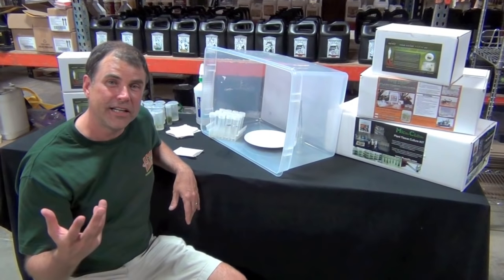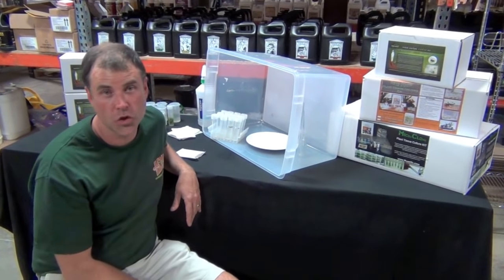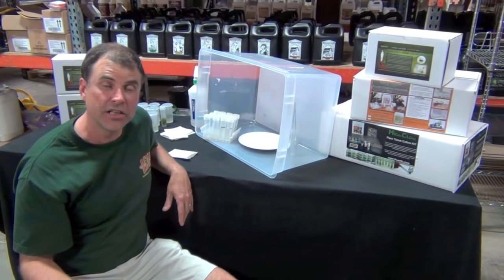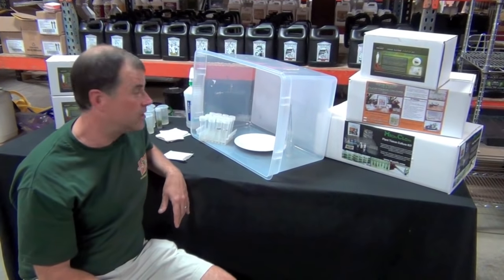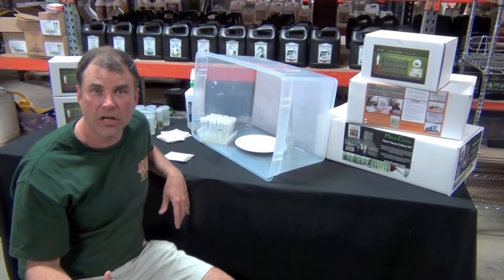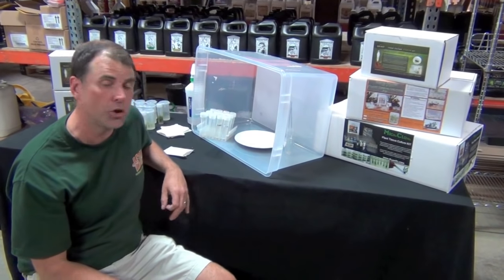What we've done is we have taken tissue culture techniques and created a seed starting kit for old seeds or seeds that are valuable that just need an extra kick to get them going. I'm going to show you what we got going.